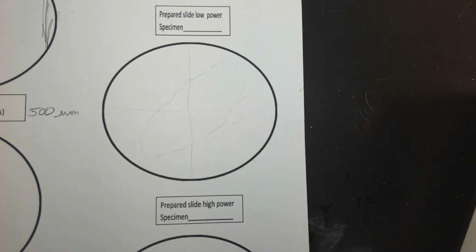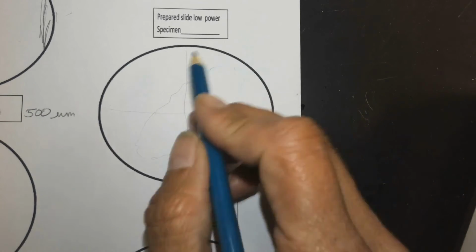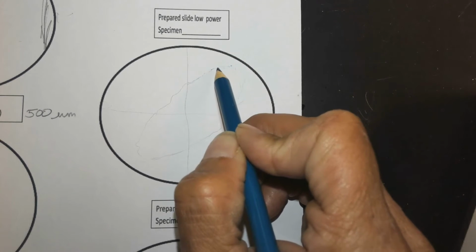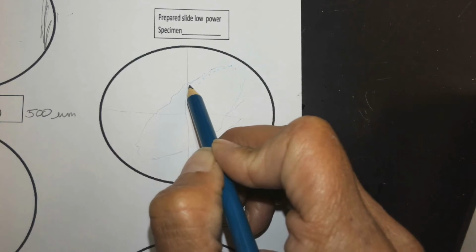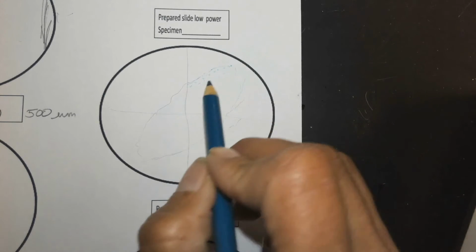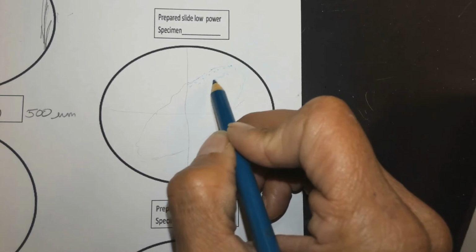I'm showing you this with a digital microscope, which has a significantly different field of view. So don't use this as an exemplar of what you should see. Yours is going to definitely be smaller under low power. And then you're going to draw. So you'll see there's some organelles along the cell, a little bit darker purple, and a little bit larger. You don't have to be an artist to be able to draw these things.